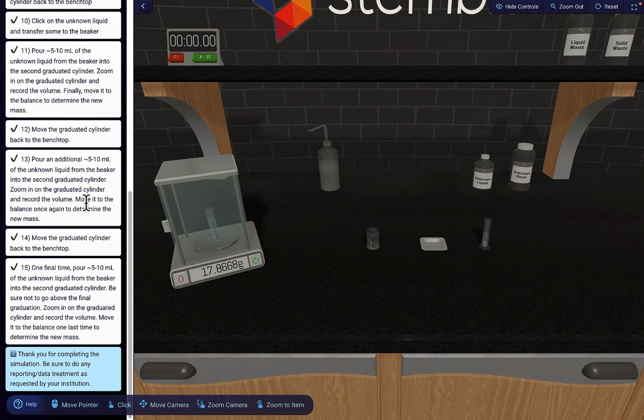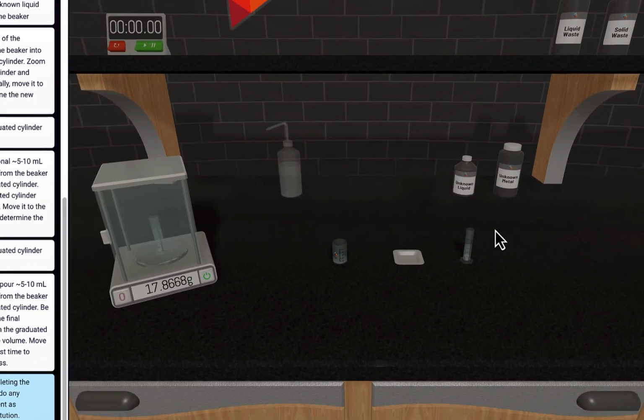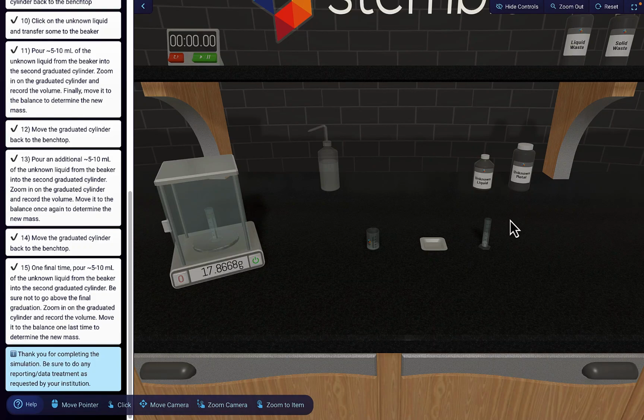That should be plenty to determine a density, and now you know the density of both your unknown metal and the density of an unknown liquid. That density is often quite diagnostic, and it will let you determine what those species actually were.